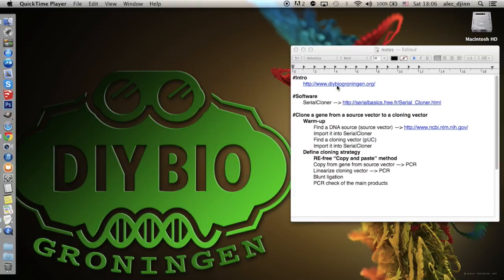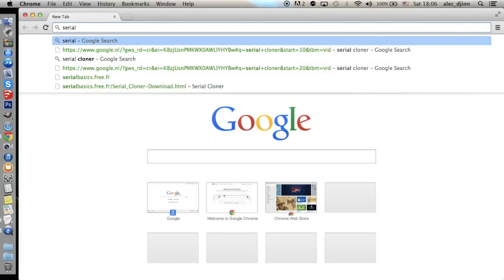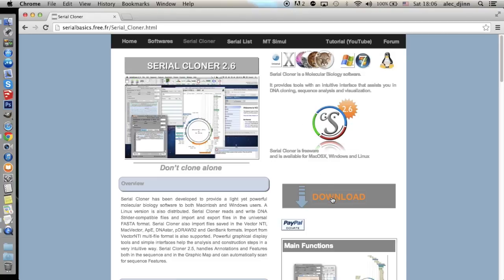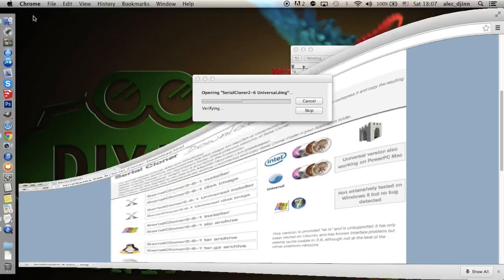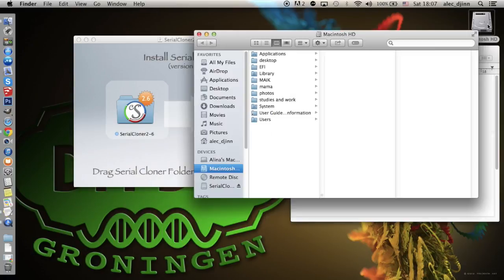Now let's get started with part one. First of all, we need the software, Serial Cloner. Let's search for it in Google and download it from the official website. I'm using a Mac, so I'm going to download the OSX version. A Windows and Linux version are also available. Let's install it in the Applications folder, and we're done. Step one is now complete.